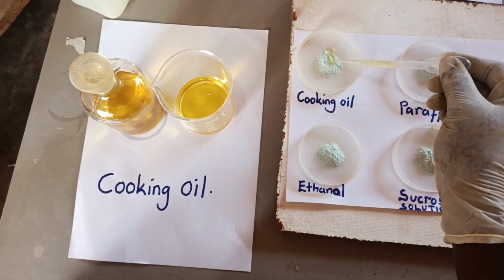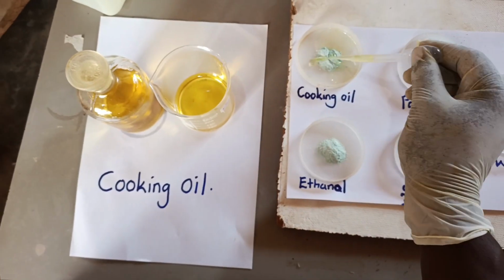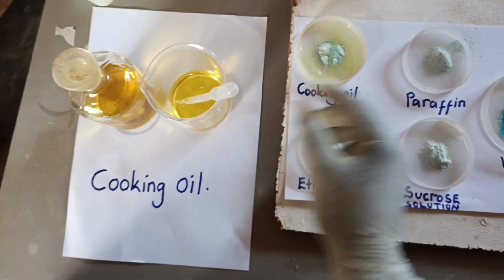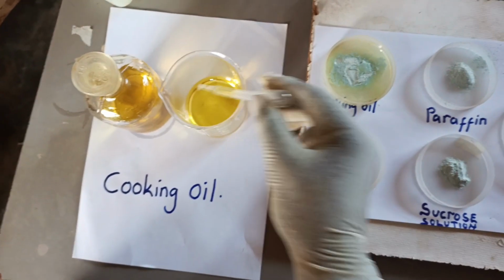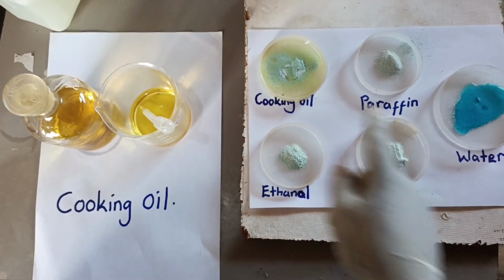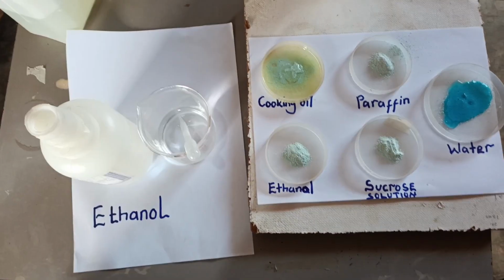When cooking oil is added on anhydrous copper 2 sulfate, there is no color change, no observable change. The color of anhydrous copper 2 sulfate remained. This implies that there is no trace of water in cooking oil.